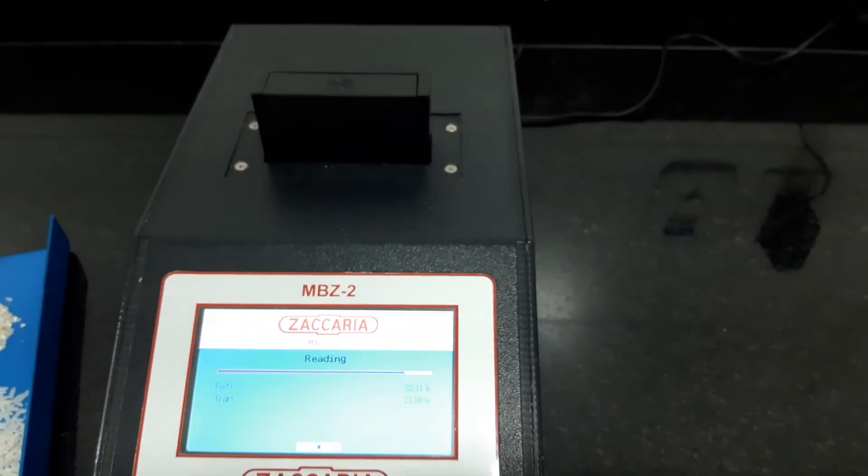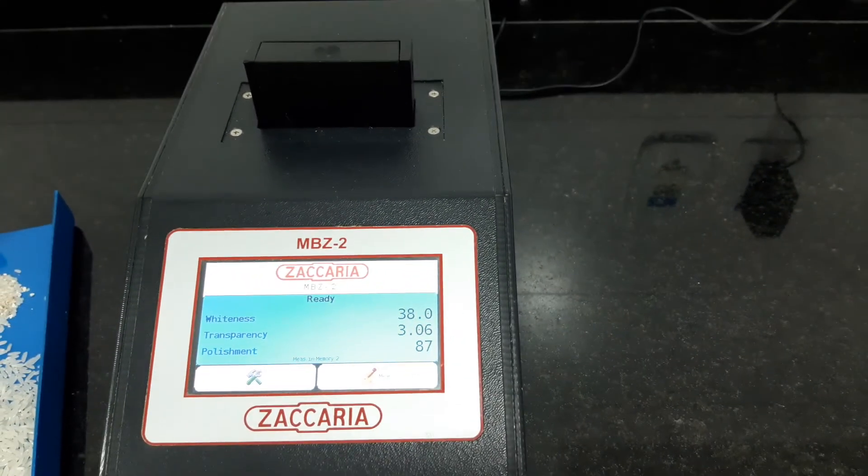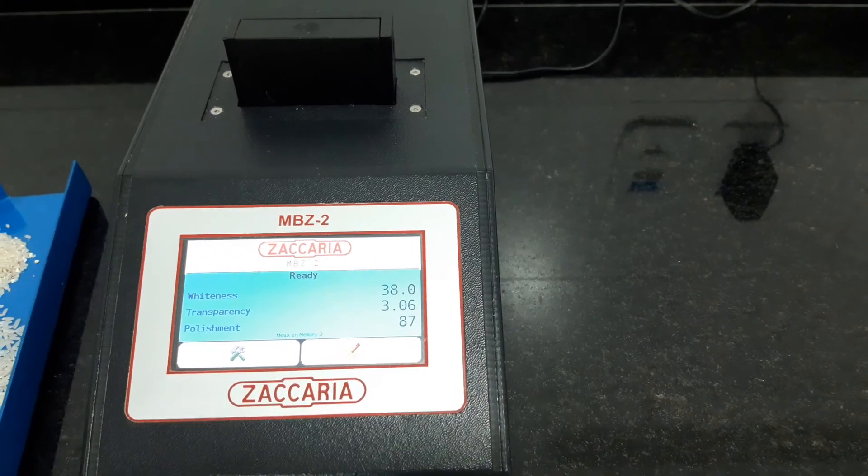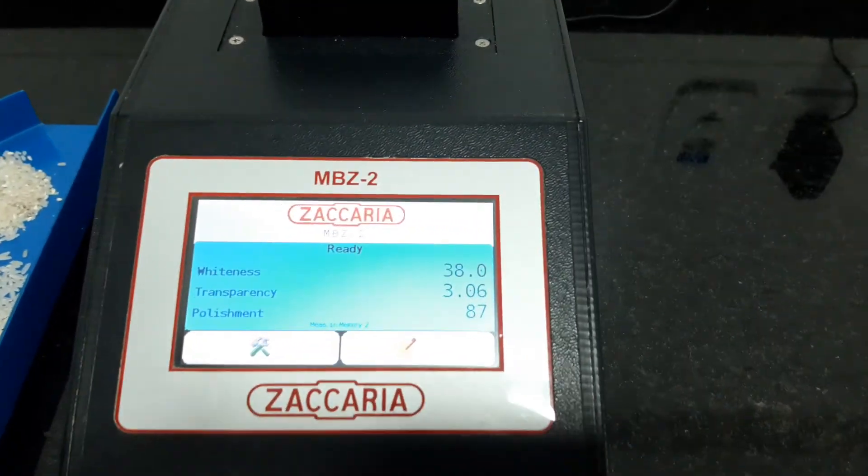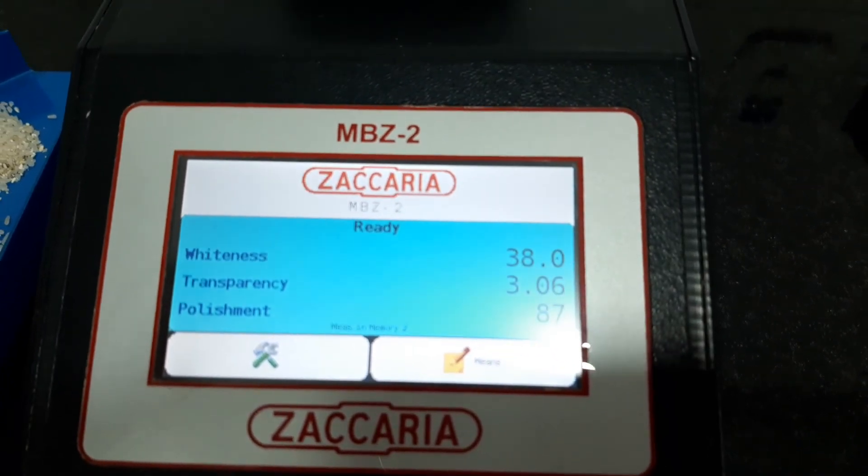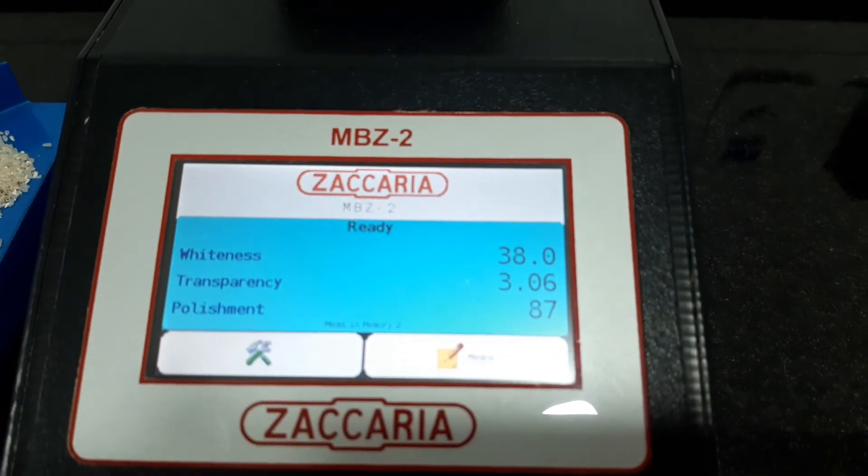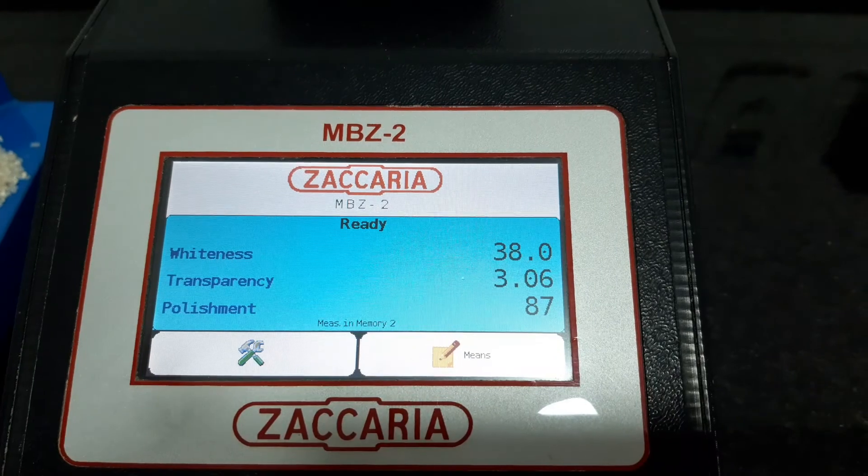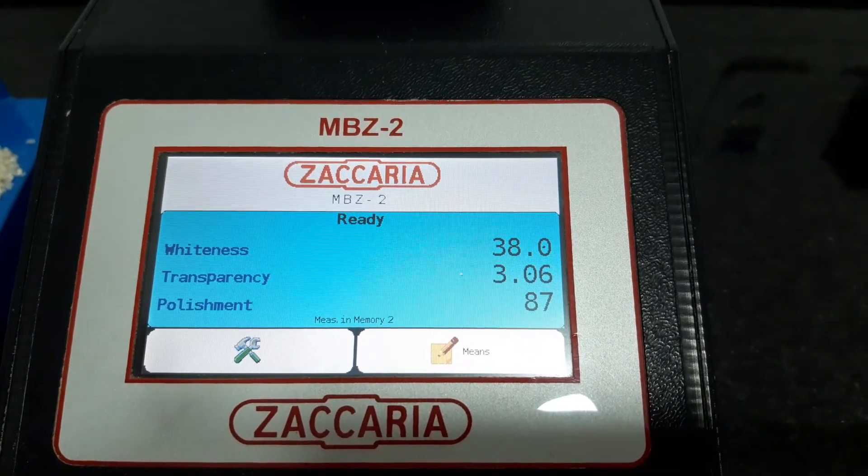The machine is reading the sample. And in the end, from this sample, we have 38 degrees of whiteness, 3.06 of transparency, and 87 degree of polishment. The polishment means the medium degree.